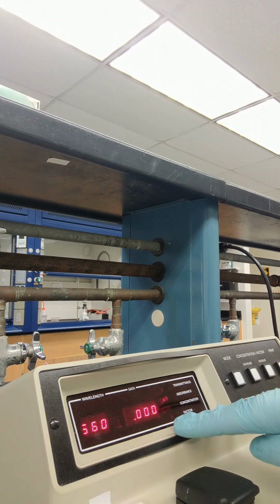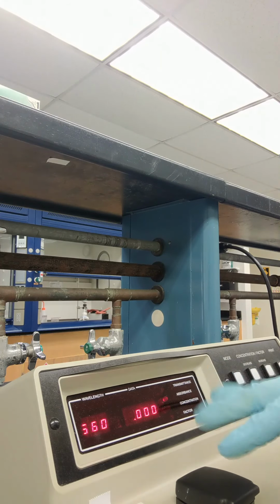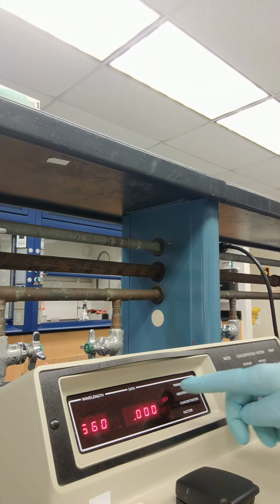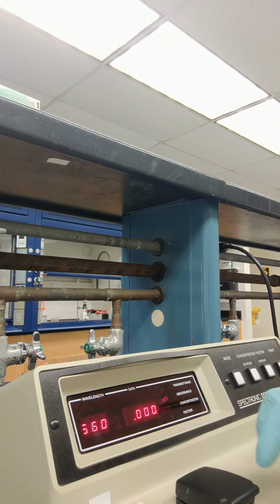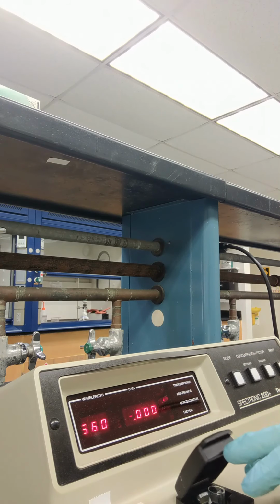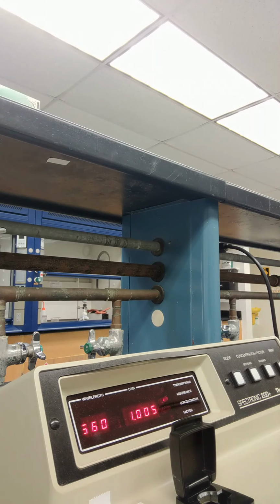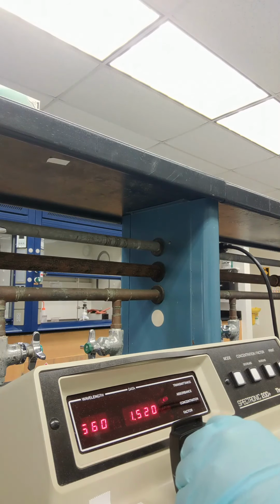So the absorbance, this is with the blank, which is just water. The water should be at 0. If it's in mode for transmittance, that will be 100% of the light passing through, and then the absorbance should be 0 because the distilled water should not be absorbing any light. So now I'm placing my sample in there.